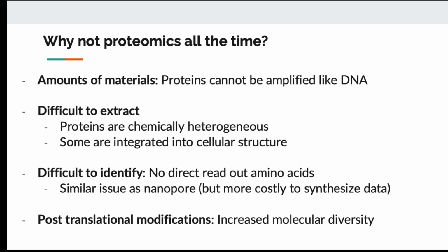So one of the key questions is, why don't we do proteomics all the time? If we want to understand biology, function occurs on the protein, not on RNA. So the most direct evidence would be the expression of proteins, not RNA.